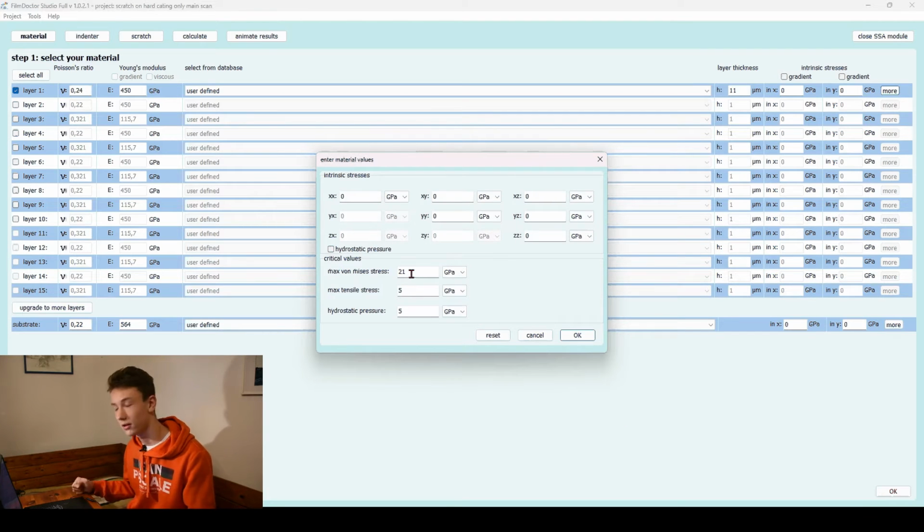What I suggest you do is go into the description, and there I have another video talking about the OPFC and explaining how you can use it, so that you can get the values that you need for the Scratch Stress Analyzer or for anything else that you might need them for.